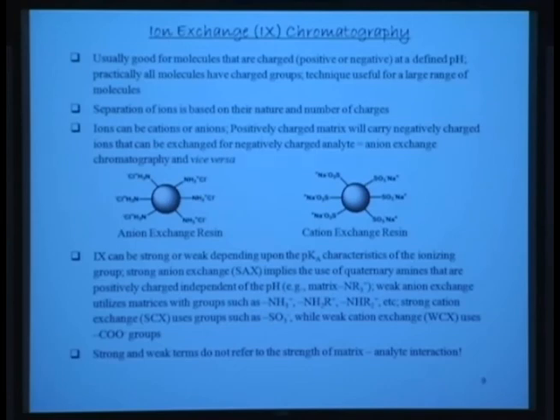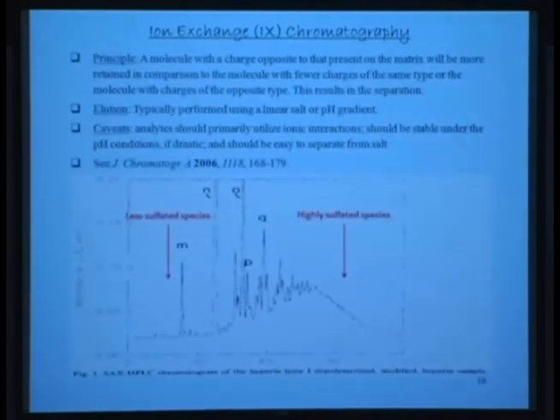So maybe all right, so this is once again from well, I don't cite the reference, but this is my work, very old, which is the reason this thing is not good. But you can see, some of you were asking me how complex a profile looks like upon heparin lyase digestion, and this is what it is.